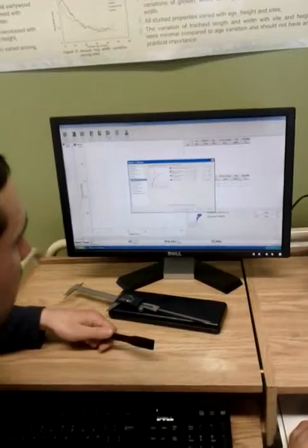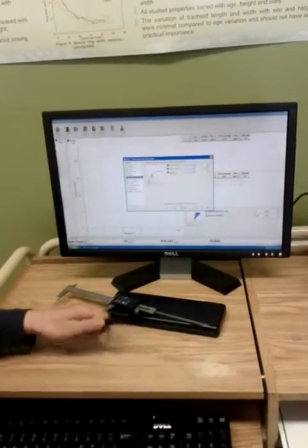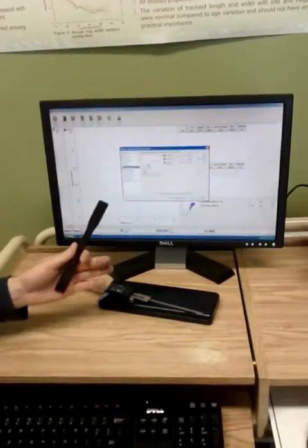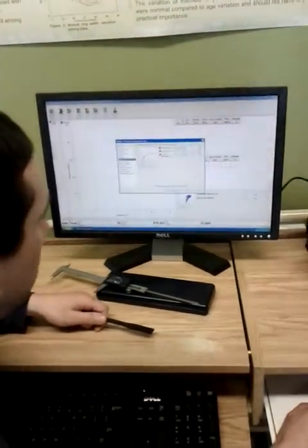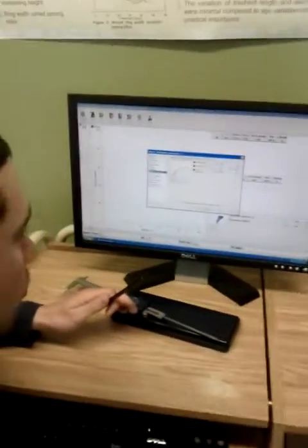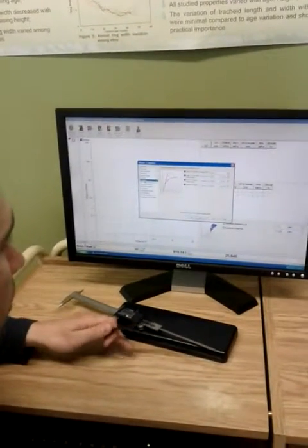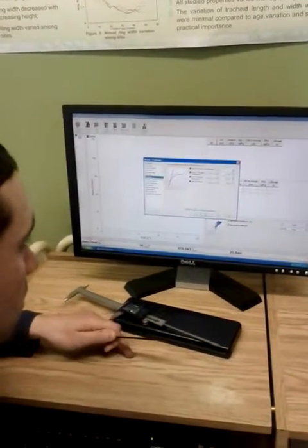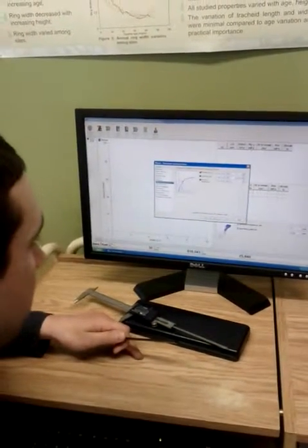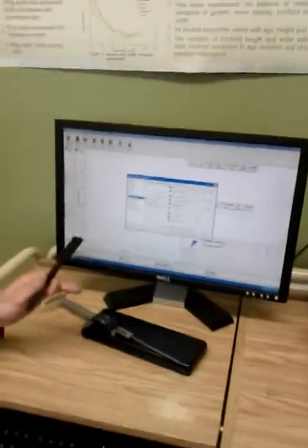We see the yield point, which is the limit of elastic and plastic, yeah. So the machine will ask you for a speed for measuring E, the modulus, a speed for measuring the yield point, and a speed for the test. You just put the same value in each place.